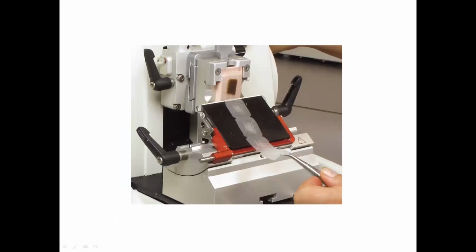So here it is, a close-up picture. This is the wax block which is fixed, and when you cut, you get thin slices of this. That is the tissue inside. This is the wax which is surrounding it. And sort of like a chain, you will get this, right?